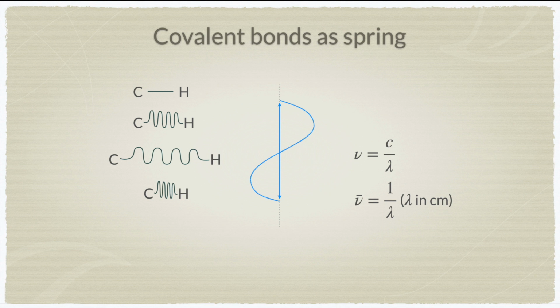What do we see here? Suppose the same frequency matches that of the IR frequency. When it matches the IR frequency, what we observe is that there will be an absorption, because they have the same frequency. The IR frequency and the stretching frequency are the same.